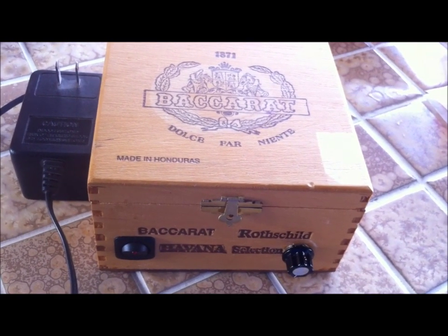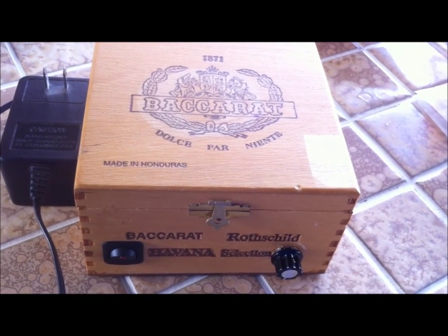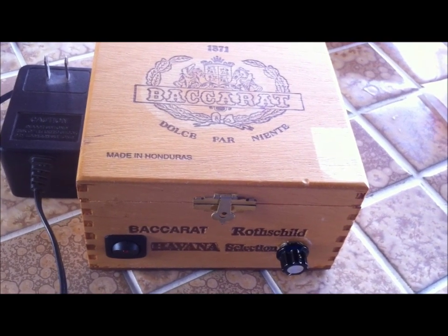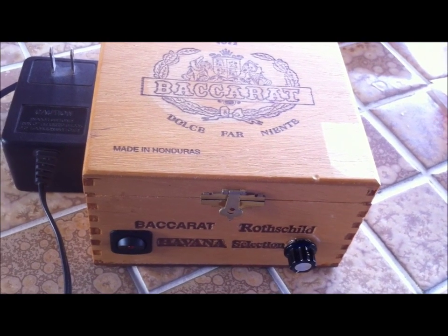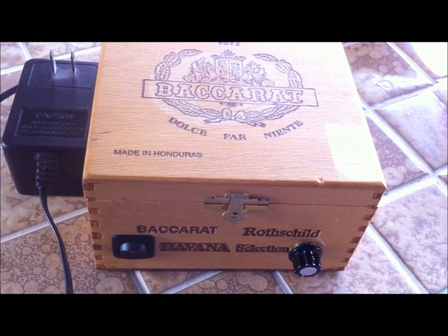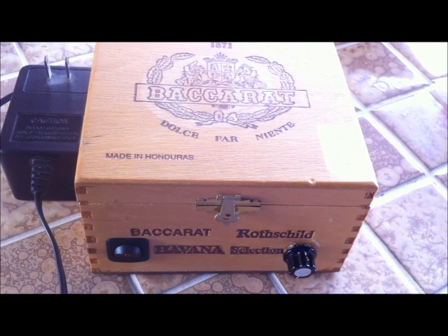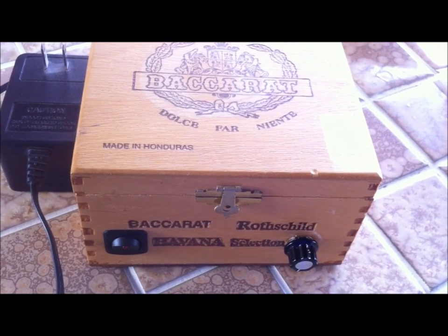The reason I wanted to build a stir plate is probably like some of you watching — because of the price. Stir plates can go for anywhere from $39 and up for a decent one, and I found this works sufficiently well. You don't have to pay a high dollar sticker price to build yourself a stir plate. Now, real quick — this is a cigar box, my old Baccarat Rothschild box that I've had for the last 15-20 years, so it's coming in handy.